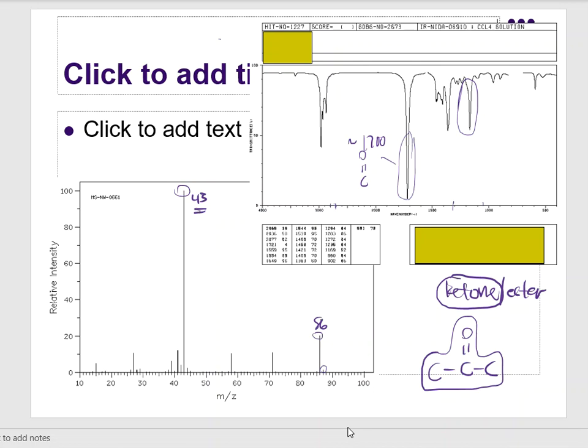That probably is due to an isotope. And if you look really closely, it looks like there's a small little peak right there. Now, is that something just on the line? Is that something that's appearing? Is that the actual M peak? Well, we'll get to that point when we cross it. But I'm going to use 86 to begin with.